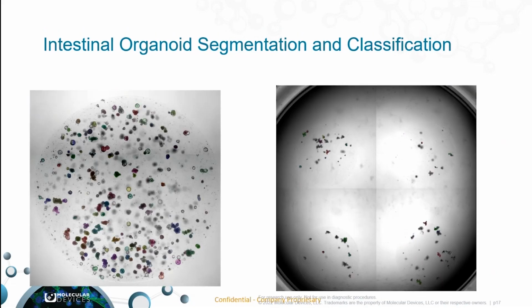These examples show that we can do the segmentation and classification not only in a small dome, but also in a larger dome, like the one on the left-hand side, or that we can place multiple domes and do the image classification also in these circumstances.